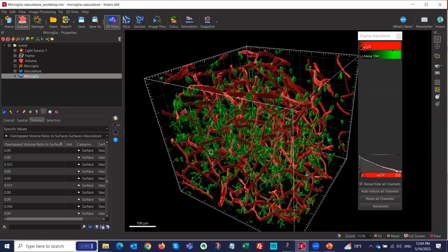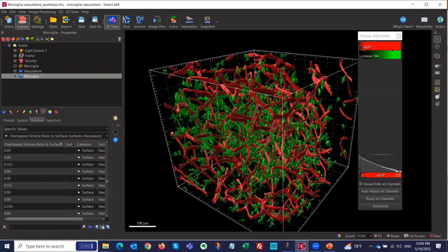But before that, I'm done with spots and surfaces, the general basic process. Does anyone have any questions that are unrelated to the graphs that I'm going to talk about here? Anything about the process of spots and surfaces? All good? Awesome. Okay, so I do want to go now in Vantage, as I promised. So this is our plotting tool.